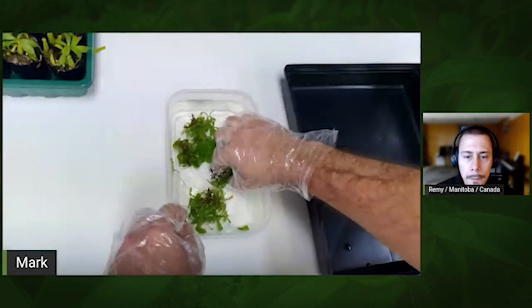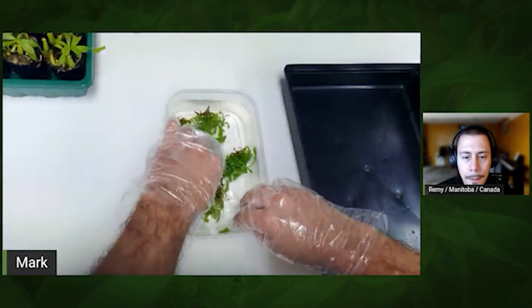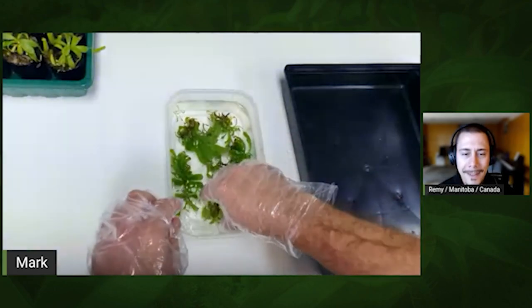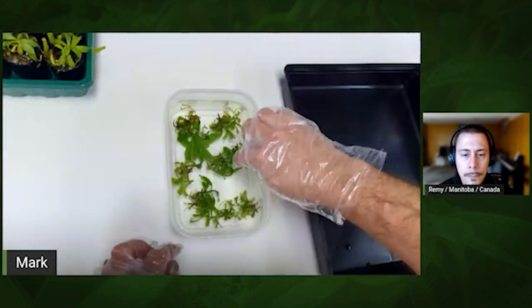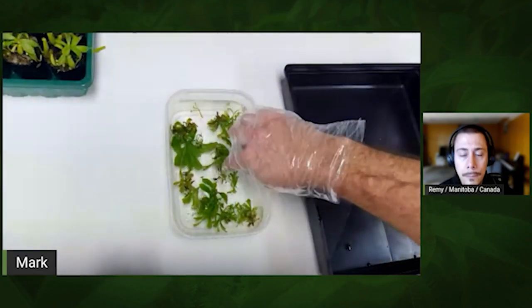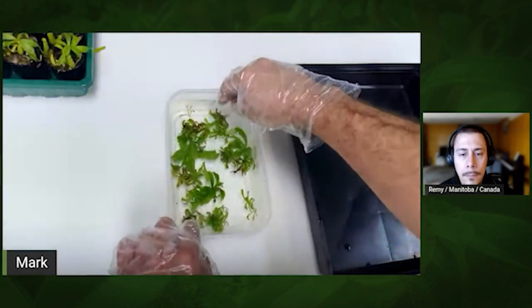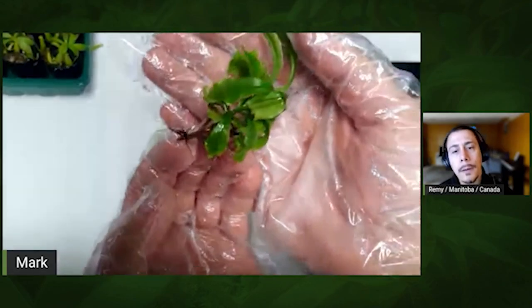Now the most boring and time-consuming process — and you really have to be careful not to break anything — is separating them into individual plants. Are there roots? It depends on the species, the plants, and the lab. Sometimes you have zero roots; sometimes you have too many roots. This one has a good root amount — really what I expect from tissue culture. For example, here's one plant and those are its roots.